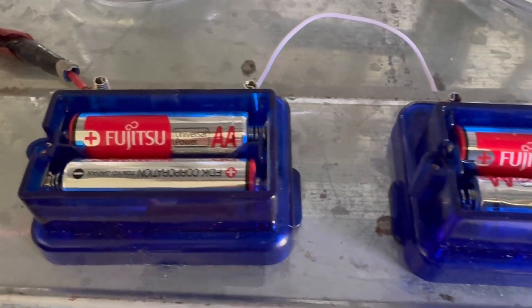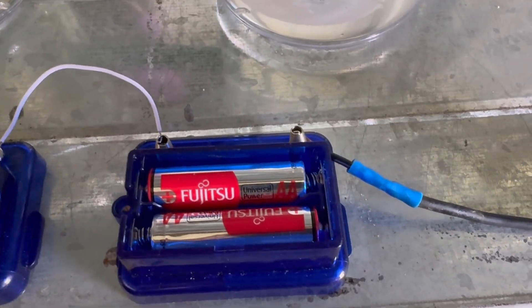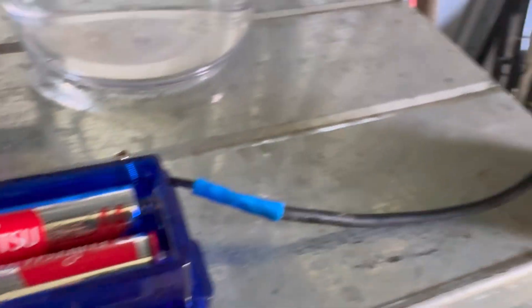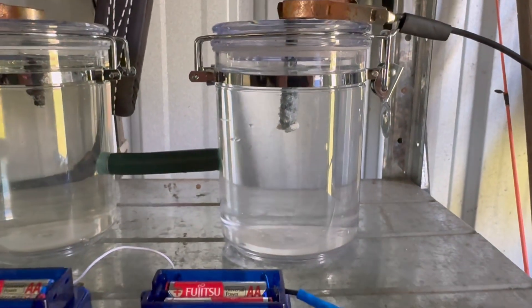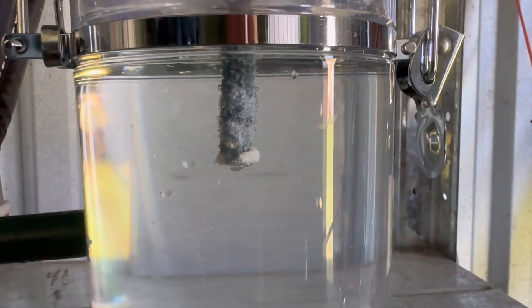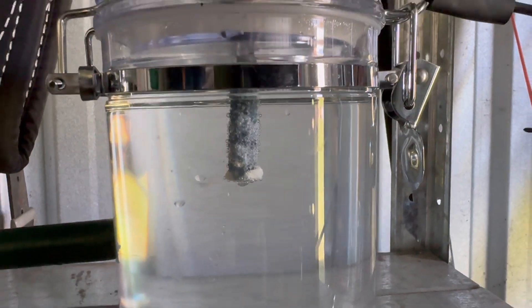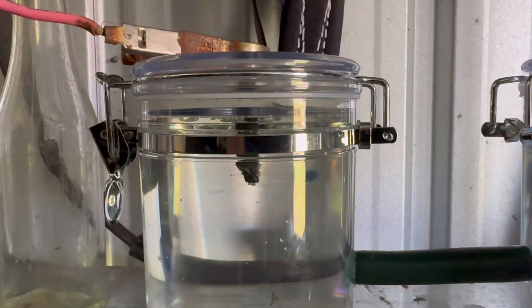Hi all, hope all is well. On today's video I want to do something a little bit different. This is my backyard electrolysis setup. What started as a simple experiment to create sodium hydroxide from seawater has turned into something completely unexpected.